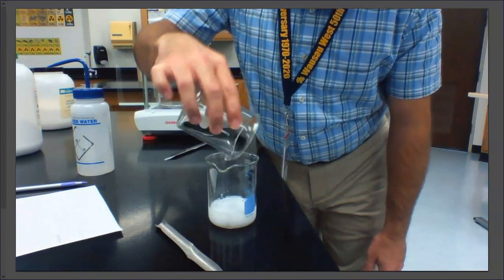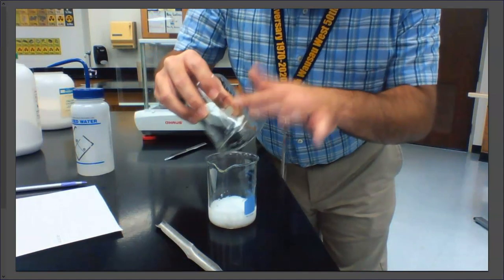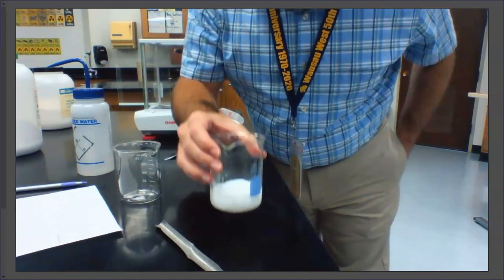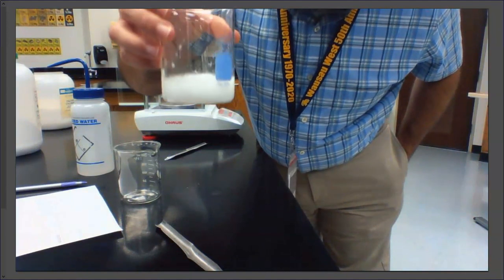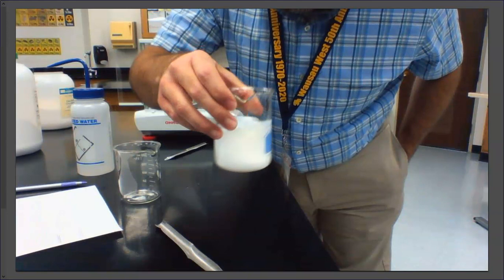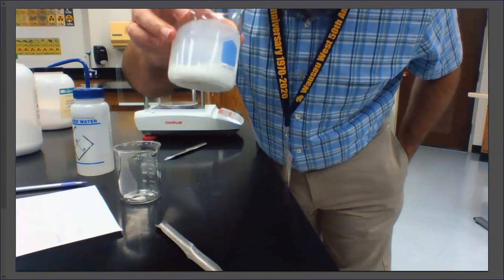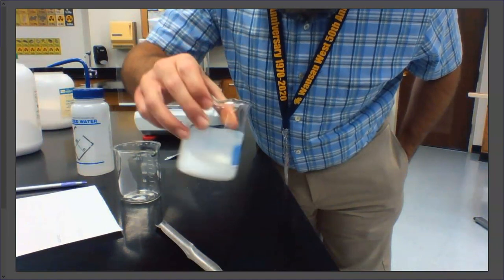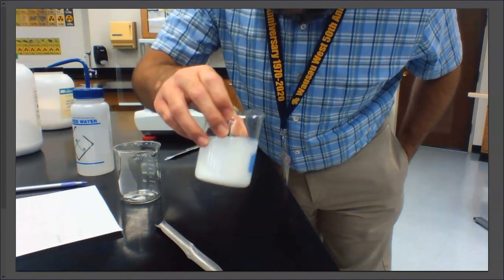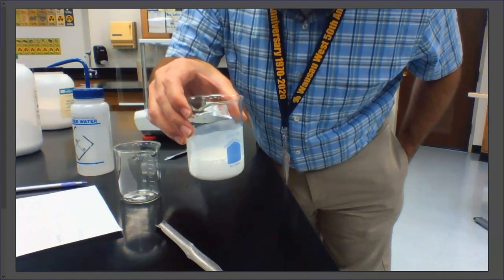okay? It turned bright white. And that white color that you see is solid forming, all right? It kind of looks like it turned into milk, right? But this is a precipitate. It almost looks like hand lotion, okay? I mean, it's pretty thick, and again, it's the precipitate falling out of solution. So this is the chemistry we wanted to see.